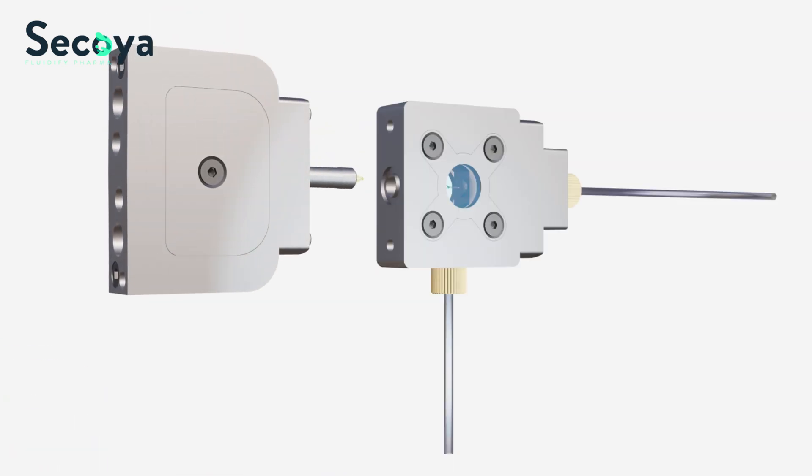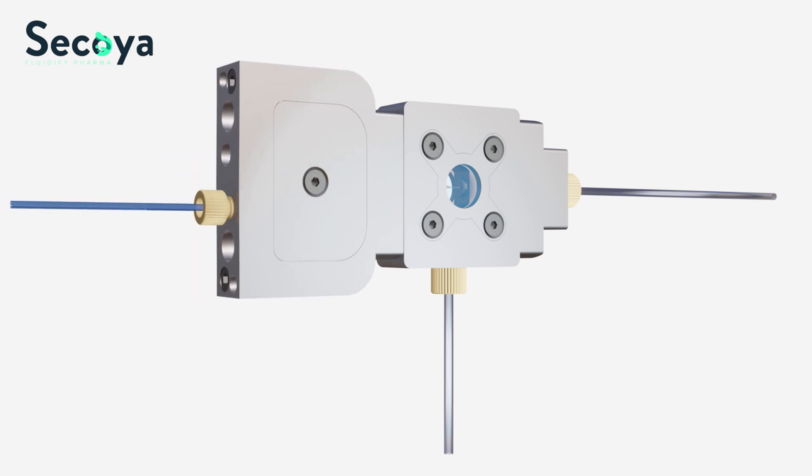The RayDrop device can produce double emulsions by simply replacing the inlet insert with an insert that can carry two liquids. One is called the core phase and the other the shell phase.